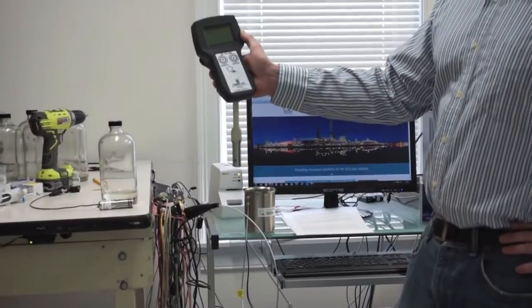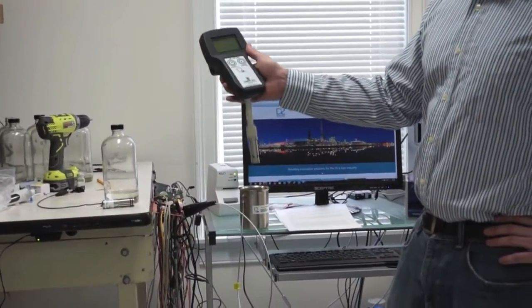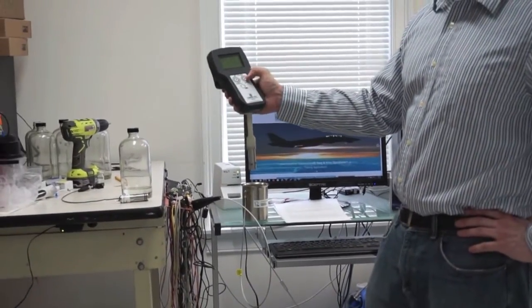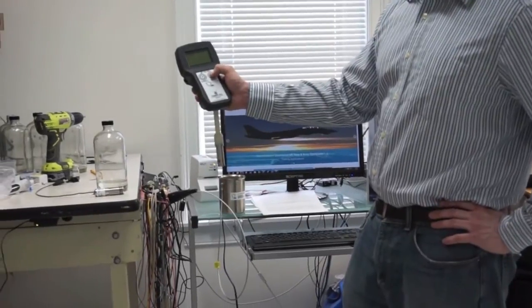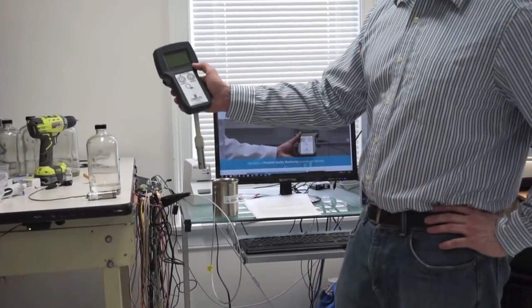If you want to maintain that on the screen, you keep it. To save it, hit enter. To clear it, hit scroll. We're going to save it, so we hit enter, which then turns the device off.